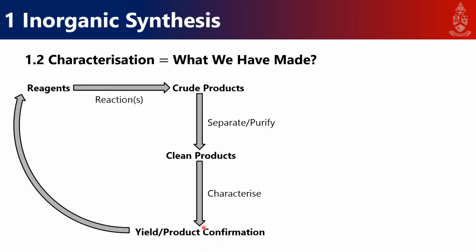And then actually sometimes you can use this product you formed and react that again to form a whole host of new products. So some subsequent reactions on whatever you form. You'll also do that in this experiment. So you'll form first something and then you'll react that again in subsequent steps. So that's the iterative process, and then whenever you want to stop, you stop at this point, right?